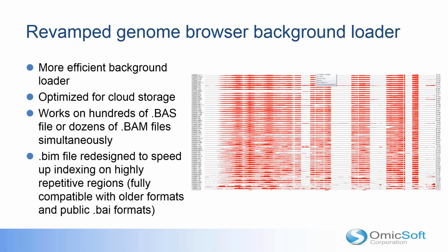So if you are really serious about BAM browsing, one recommendation from us is to delete existing BIM files and re-index BAM files to take advantage of the new format.